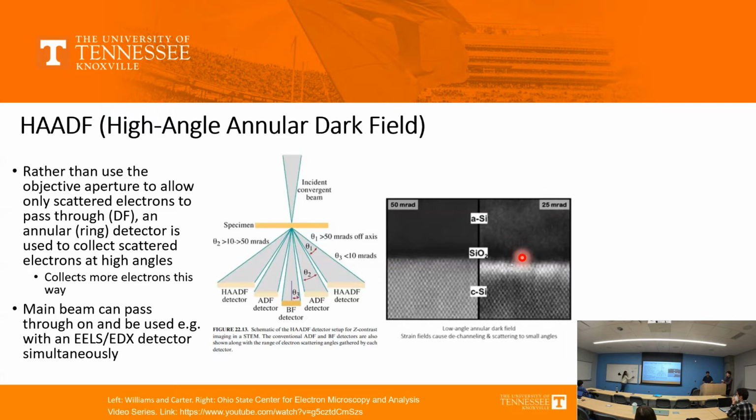This is giving me the entire composition of your sample, like the composition of precipitates. Whenever you have the term scanning TEM, we talk about coming to the zone axis and doing the analysis. It's an overall technique.